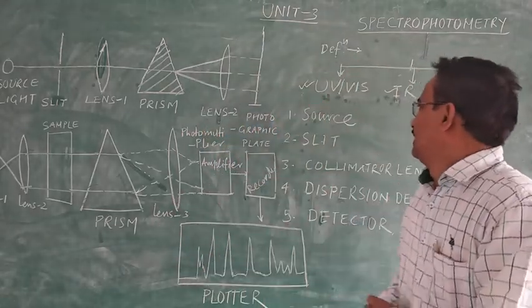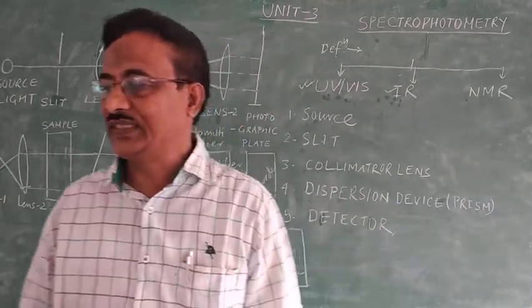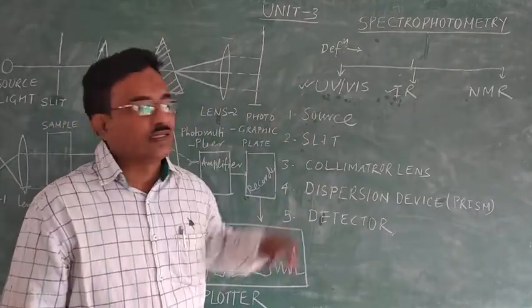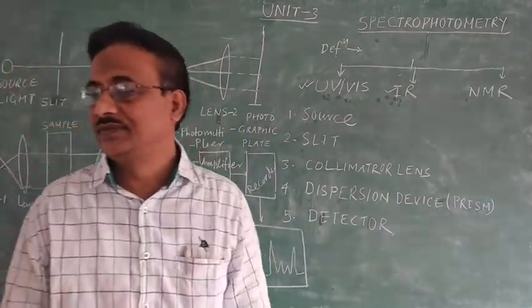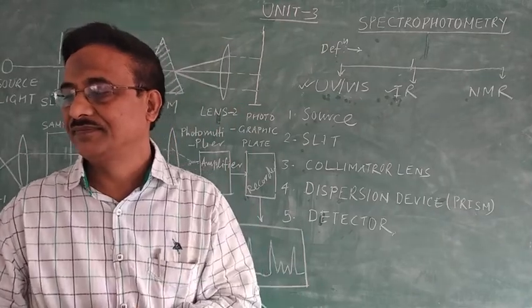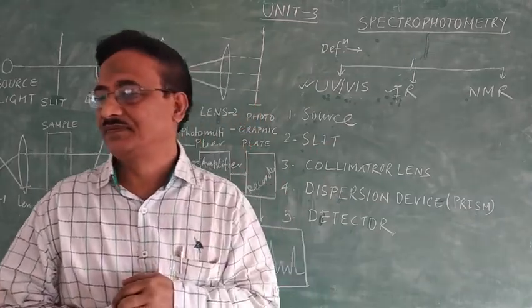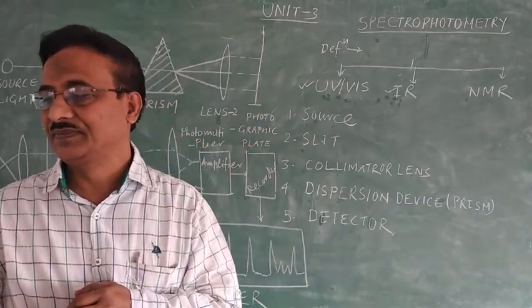So come to the first point, that is source. What is source? There are two types of source. First, for emission spectra. Second is absorption spectra or spectroscopy.